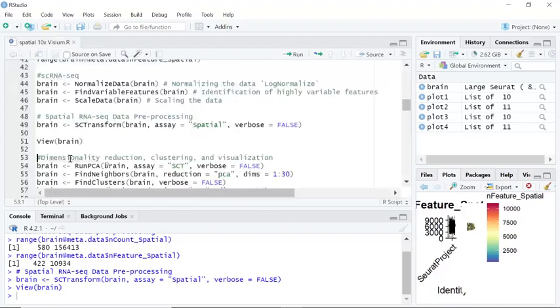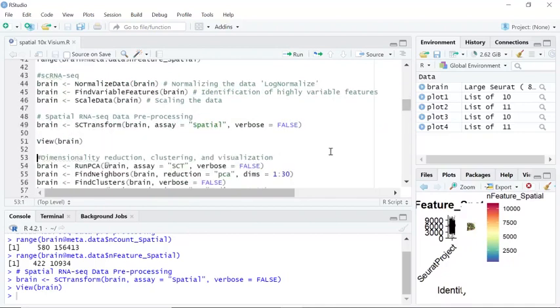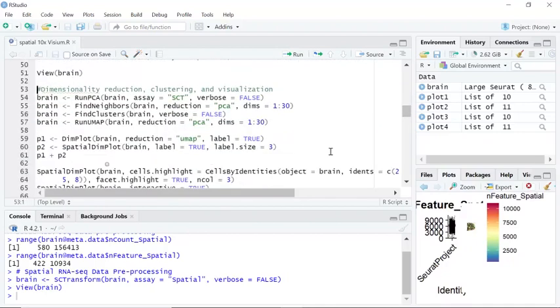For dimensionality reduction, the rest of the steps are very similar to single cell RNA sequencing data analysis.